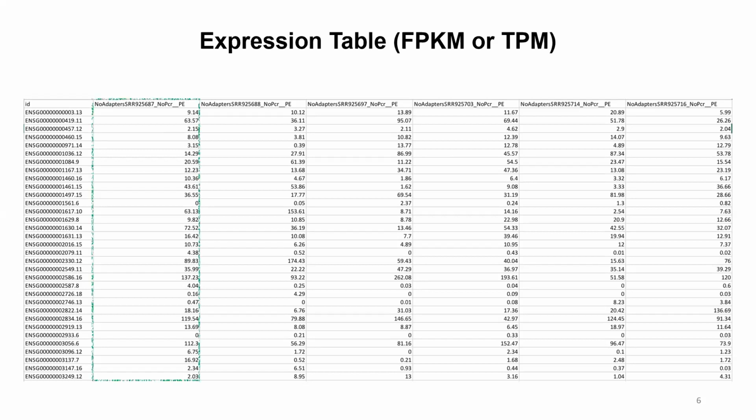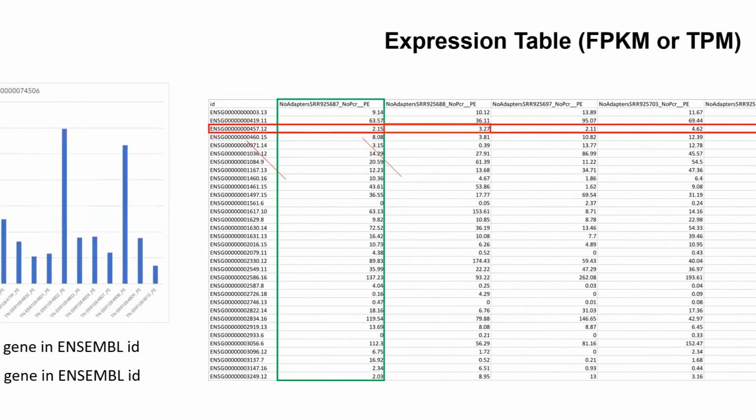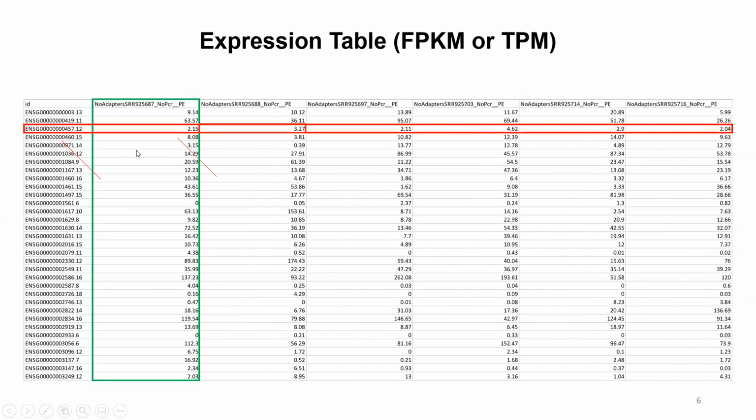So usually the way it's organized, if you don't remember, is that for some reason labels aren't here, but I will annotate. Can someone give me host privileges so I can annotate? Anybody's there? Yes, rows are genes. Perfect. And the columns are samples. That's great. So usually when you do an RNA-seq experiment, your end result will be an Excel or a table of this form, which you need to process. And it can come in fragments per kilobase million or transcripts per kilobase million.